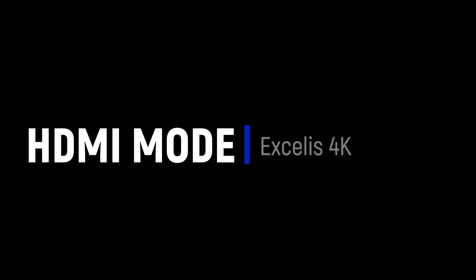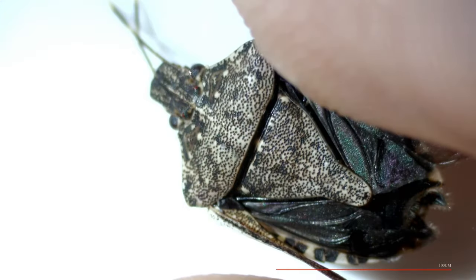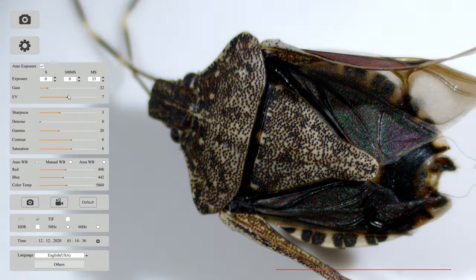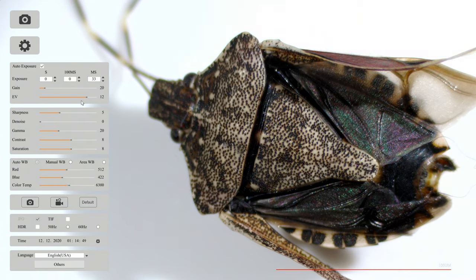Let's take a look at the onboard software when running through HDMI. Here you can see I have my capture icon — this is going to save an 8 megapixel image directly to the USB jump drive. Below that I have my settings icon. If I toggle on my camera settings, I have auto exposure; I can uncheck that for a manual exposure. EV is my target brightness setting. And down below that I have the traditional camera controls: sharpness, denoise, gamma, contrast, saturation. These are all pre-capture settings, so whatever I see on the screen is the exact image that's going to be saved when I capture it.